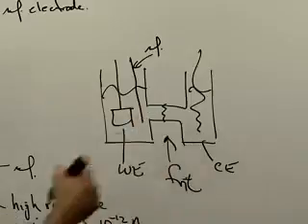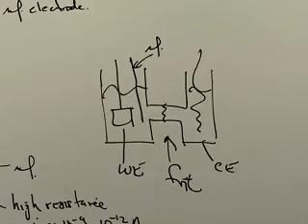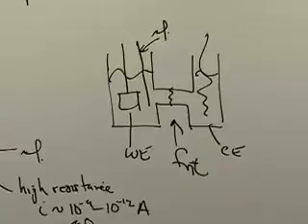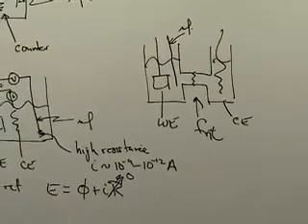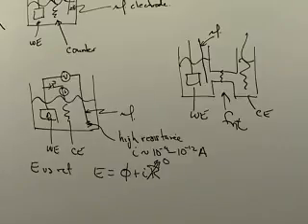Because if you put it over there, now you have the frit that's built into the reference electrode, plus the frit in your cell, plus the solution resistance, and that's a good way to get to very, very high resistance, and this can take on a significant value. So it's easy to be off by a couple hundred millivolts if you're not careful about this. Likewise, if you're just working in a single compartment in a beaker, put the working electrode and the reference electrode as close together as is reasonable. Don't try to get them far apart. Try to minimize this, and that way you won't have too much concern about it.